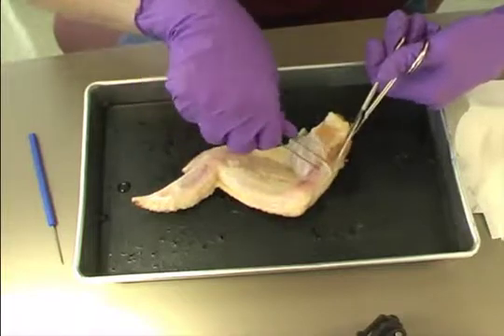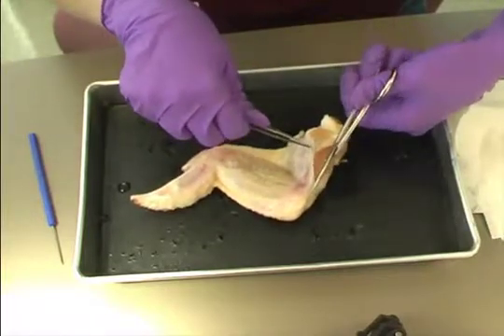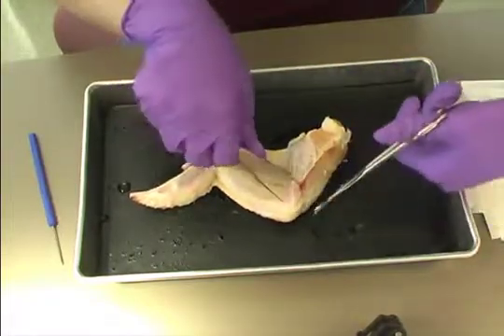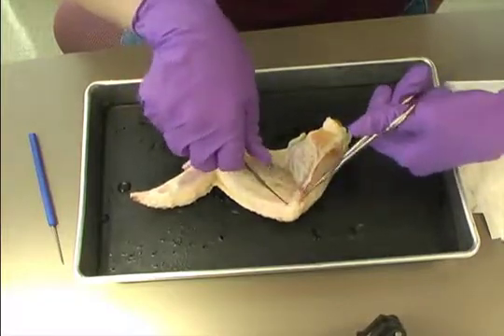Using the scissors or scalpel, make a long incision from the upper part of the wing to the wing tip. It is easier to use the side with less meat. Slide the scissors between the muscle and the skin, lifting the skin away from the muscle, and cut the skin from the muscle.